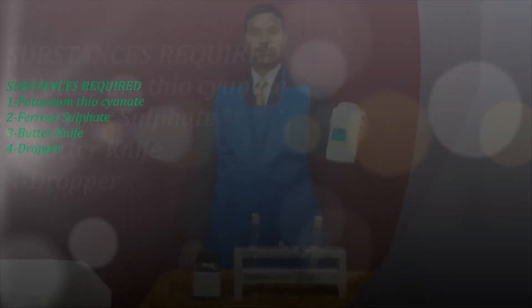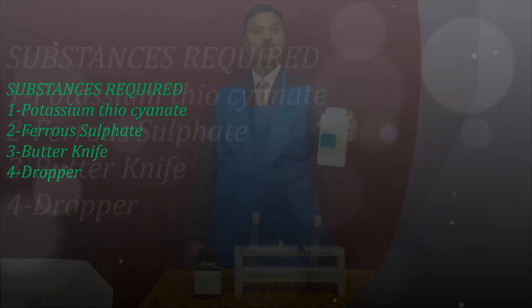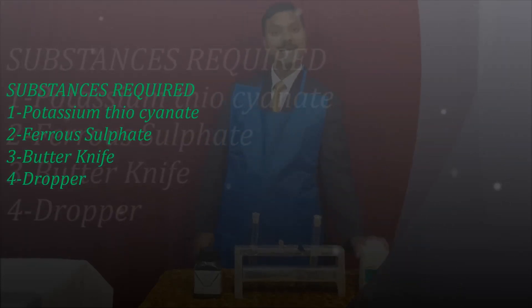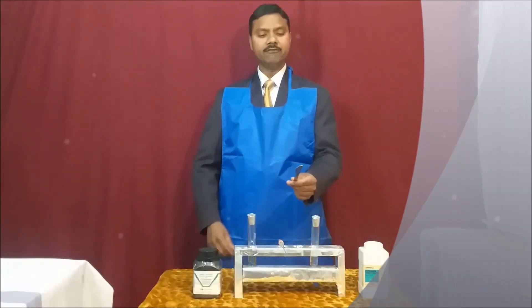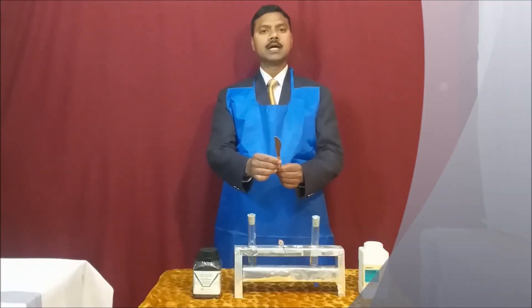For this experiment you need a few substances. First, we need potassium thiocyanate — formula is KSCN — and ferrous sulfate, FeSO4. Here in one test tube I have taken the concentrated solution of potassium thiocyanate, and in the other test tube on my right is the ferrous sulfate solution.